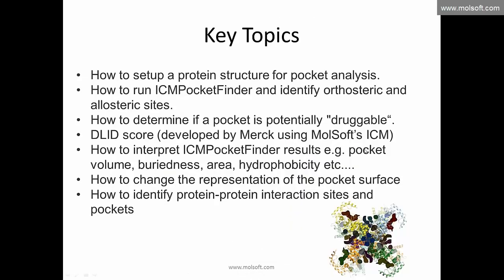The key topics for today's webinar are: how to set up a protein structure for pocket analysis, how to run ICM Pocket Finder and identify orthosteric and allosteric sites, and how to determine if a pocket is potentially druggable. We'll also look at the Merck-developed score for determining how drug-like a pocket is, pocket properties such as volume, area, buriedness and hydrophobicity, how to change pocket surface representations, and at the end we'll look at protein-protein interaction surfaces — pockets that are more exposed and less hydrophobic.